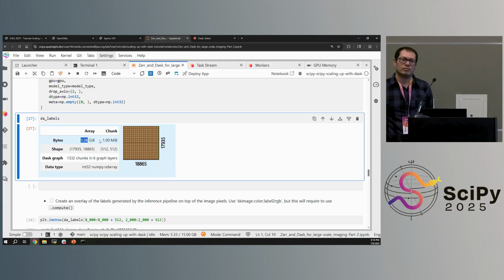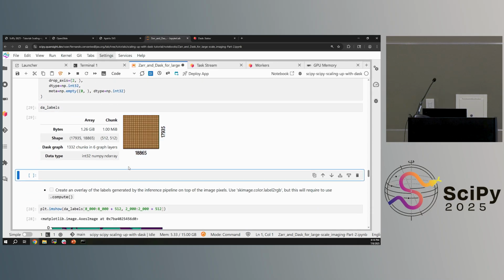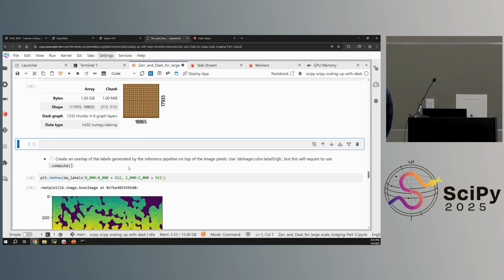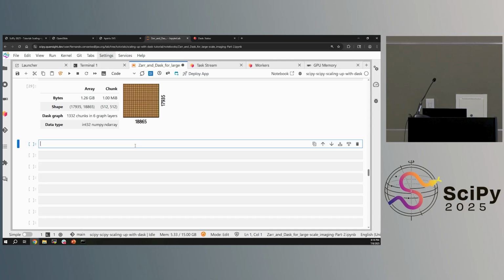But was that code that you entered, or was it in the notebook? Okay, because otherwise we should fix it in the notebook, because that's a small little bug. So you're basically overlaying the image over itself, and that's why it's just turning dark, right? Because you're taking the image and putting it on top of itself. So this is correct, you're showing it over the original image. The labels cell is the computed labels layer, so you have it correct.